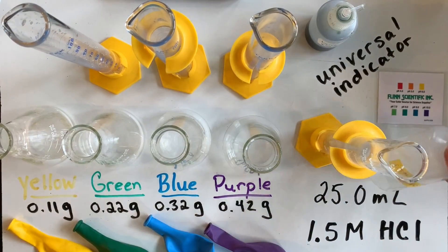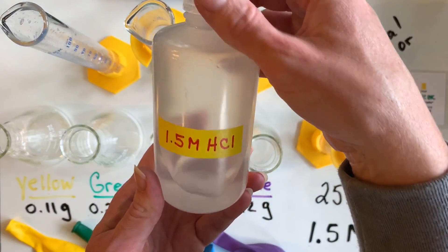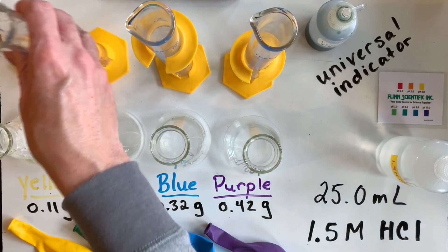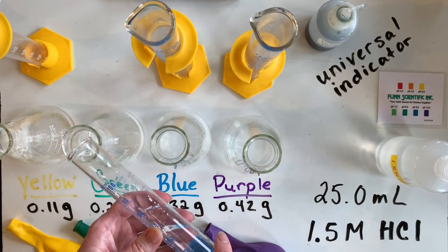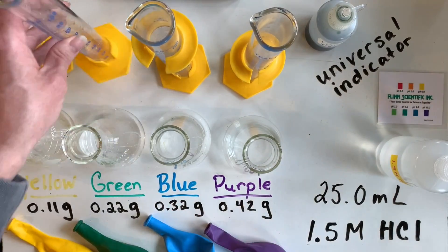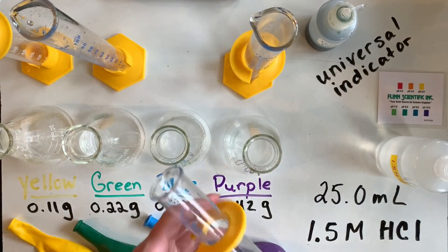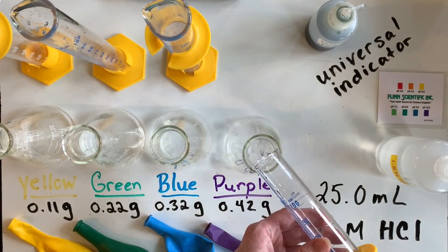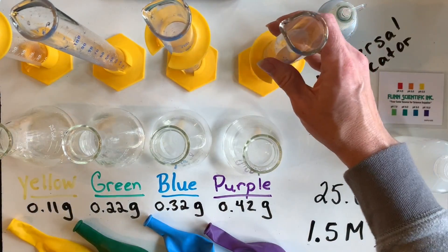25.0 milliliters of a 1.5 molar hydrochloric acid solution was pre-measured out and then placed in each of the Erlenmeyer flasks, one for each of the different samples of magnesium, which are inside the yellow, green, blue, and purple balloons.